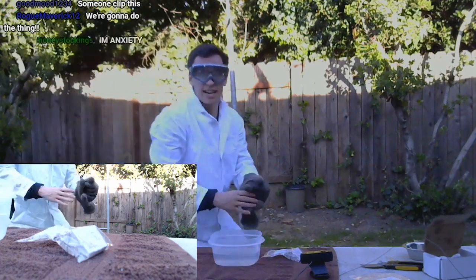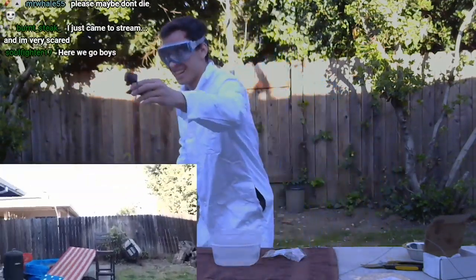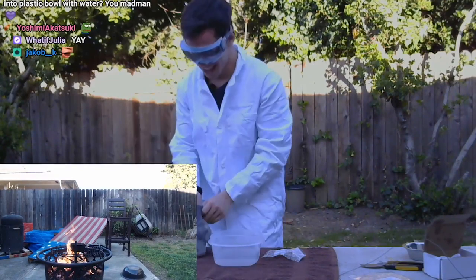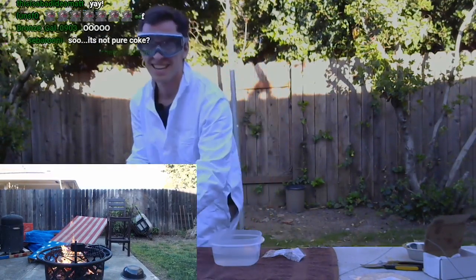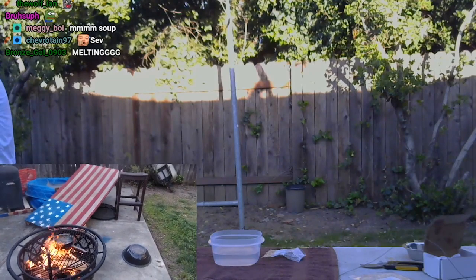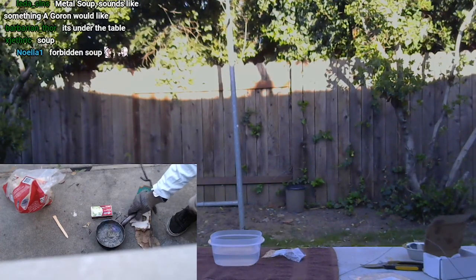Oh my God, it's melting! Guys, it's melting! Holy — it's melting! Oh my God, look! Pause everything — we're not doing sodium yet. That is bismuth soup. That is molten bismuth right there. I don't know if you can see the rainbow colors. It's really cool.